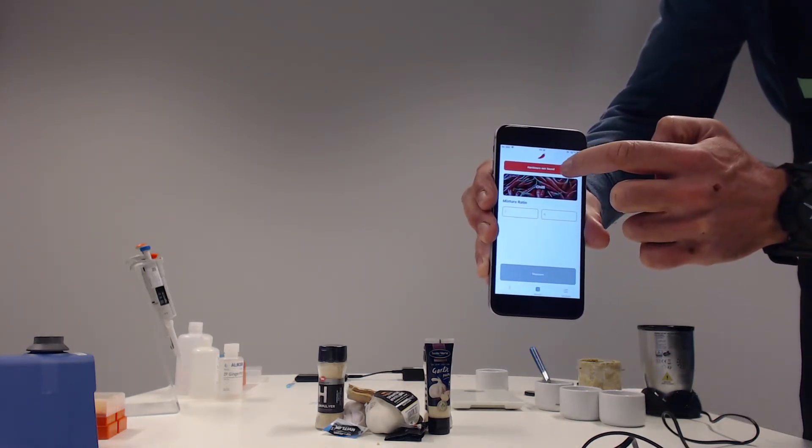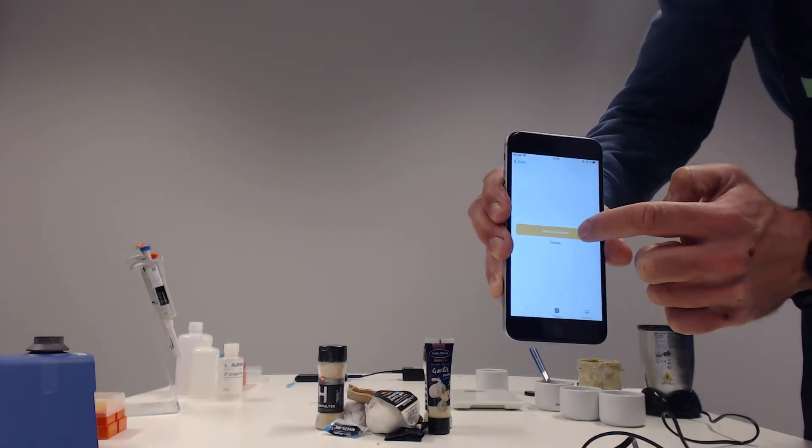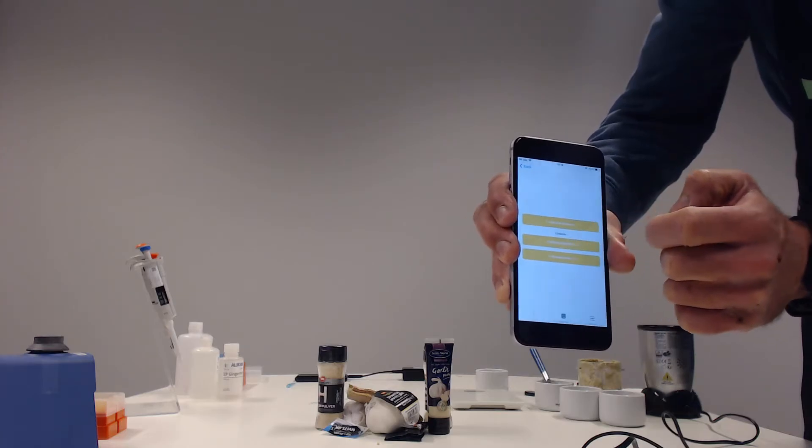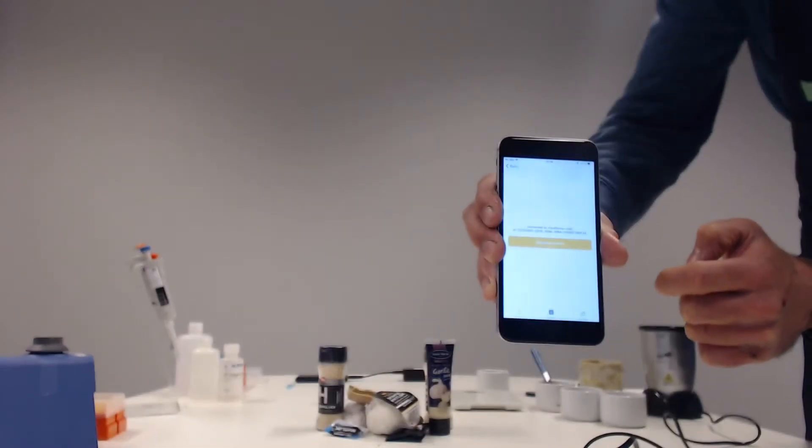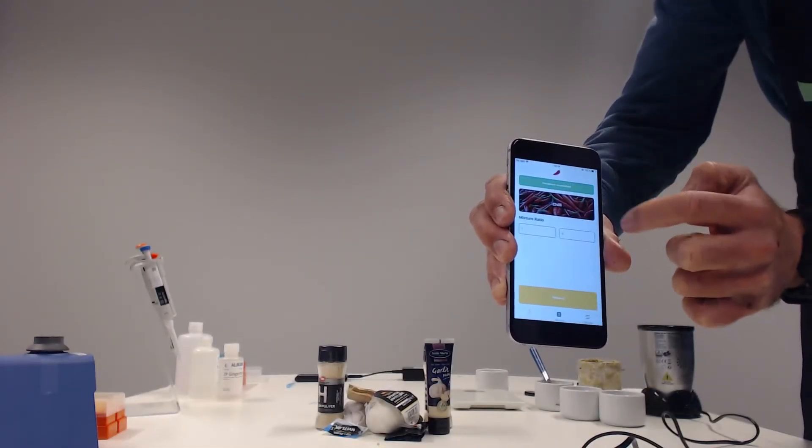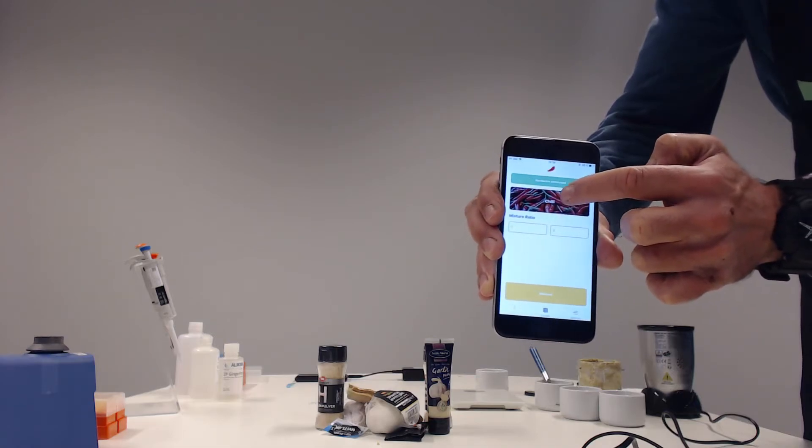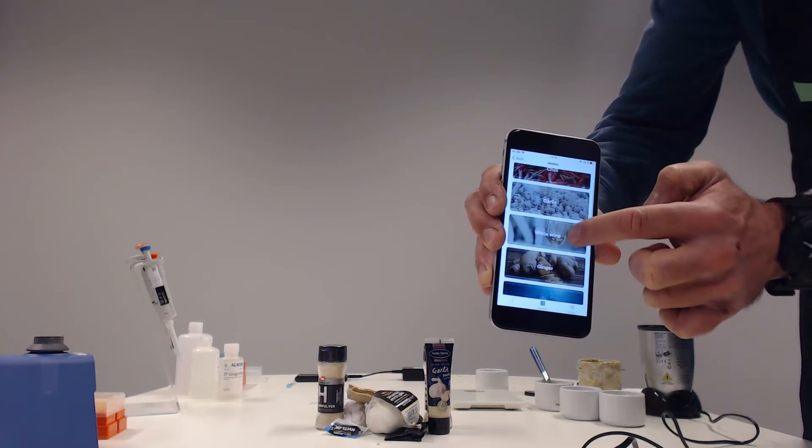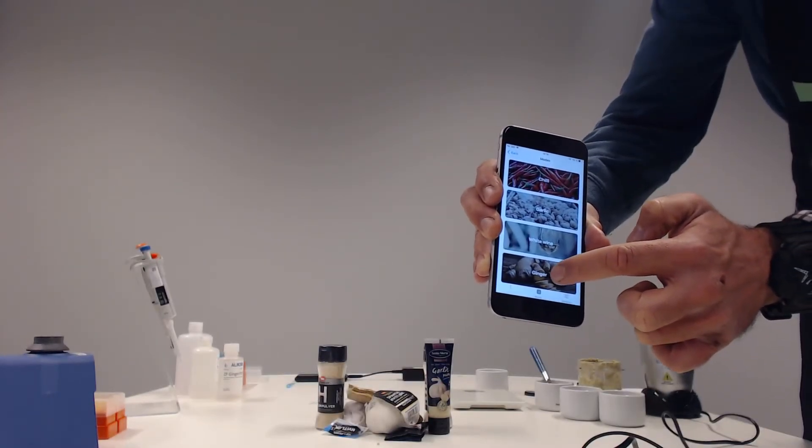So I will open the app. Hardware not found is what it says, so I will have to rescan and find my device, which is there. So I connected to it. I go back. By default it comes on the Chile menu, but I will press it to come to the main menu where I can choose the different analytes. In this case, I'm going to press Ginger.